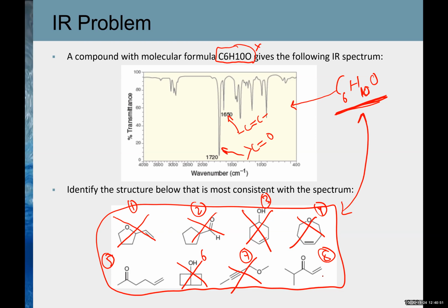Again, let me listen to your logic again. Why 5 and why not 8? Well, 8 has 2 CH3s and 5 has 1. I know we have nothing to compare it to, but I'm just saying that the CH3... No, that's not. The intensity comparison is not wise, because intensity is quite misleading. It may be quite high, maybe low. We never compare intensity.